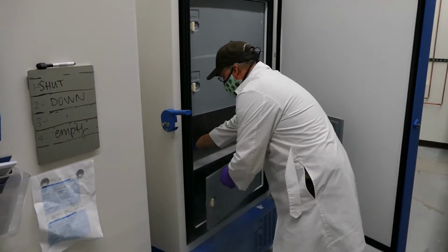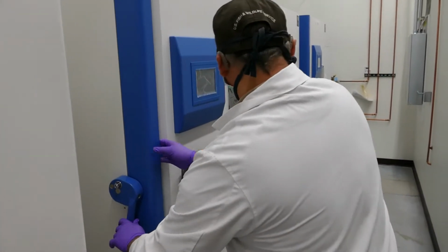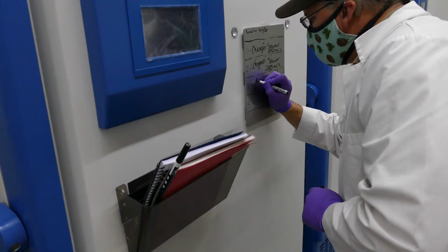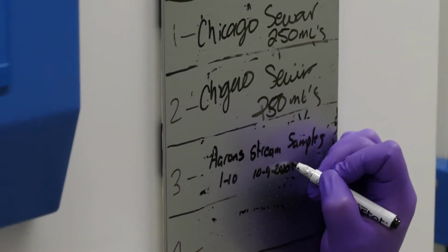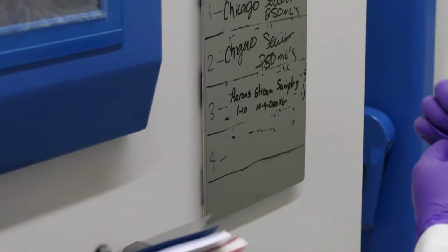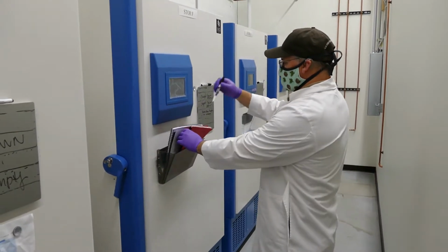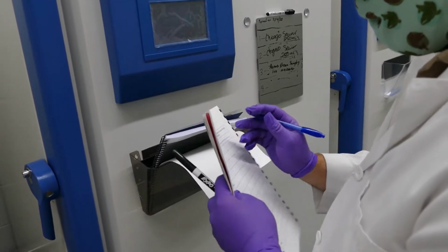Place the samples in a freezer and put which samples are on which shelf of the freezer on the dry erase board and initial and date. Then fill out the logbook. Always make sure to use a pen with blue ink to fill out logbooks.